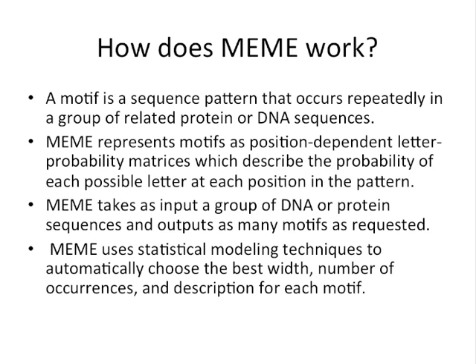But this could also be used for other related DNA sequences. MEME represents motifs in a position-dependent letter probability matrix, which describes the probability of each possible letter at each position in the pattern, and you'll see an example of this later.